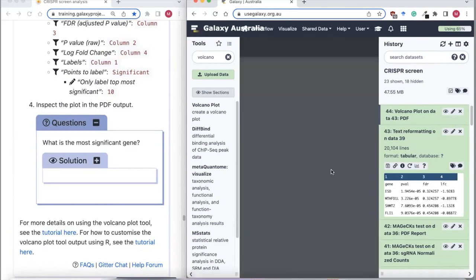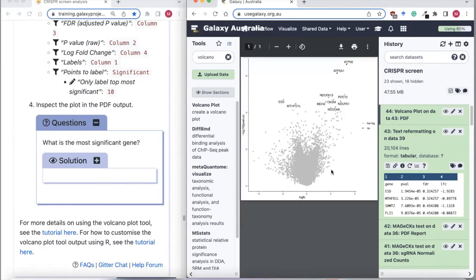Looking at the results, we get a volcano plot with significance on the y-axis and log fold-change on the x-axis. Positively selected genes are to the right of zero and negatively selected genes are to the left. In this case, these negatively selected genes are our genes of interest.